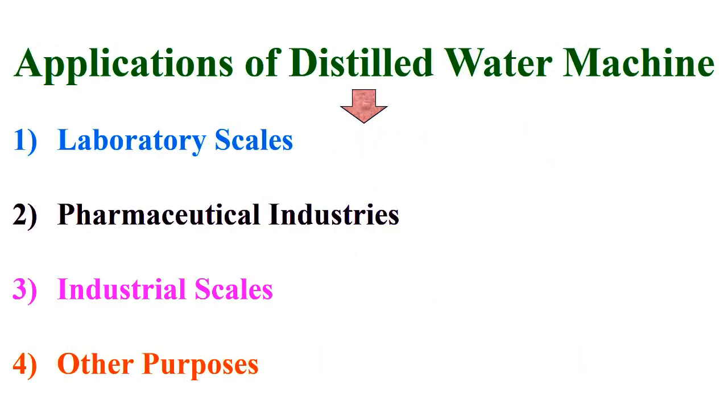Therefore, the distilled water machine is used in laboratory scales, pharmaceutical industries, industrial scales, and for other purposes.